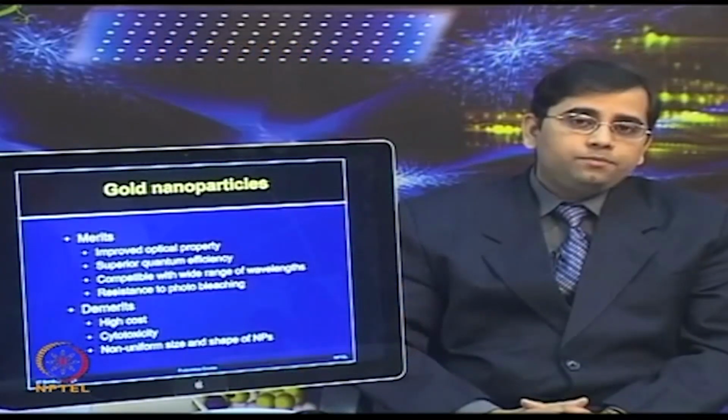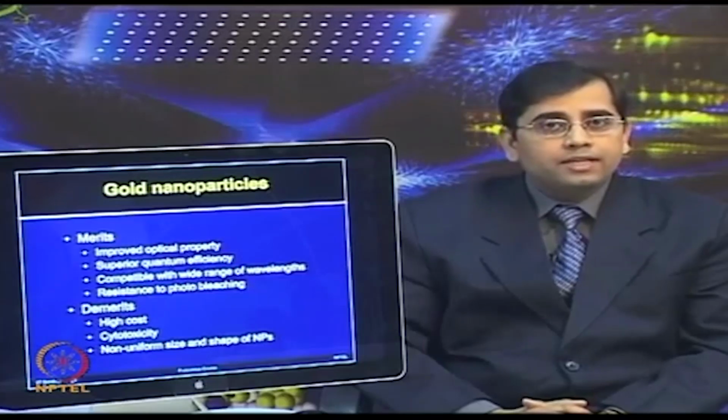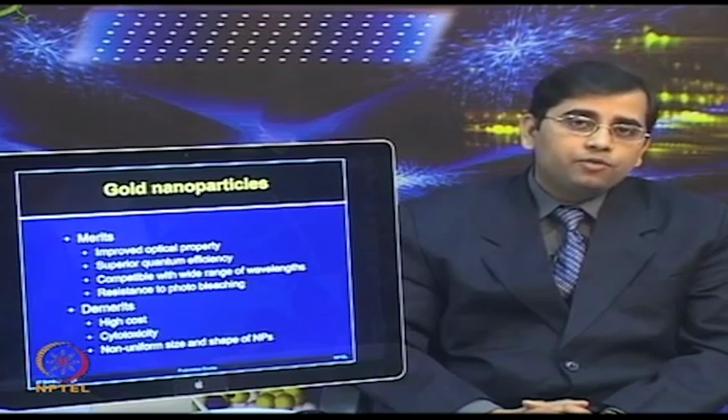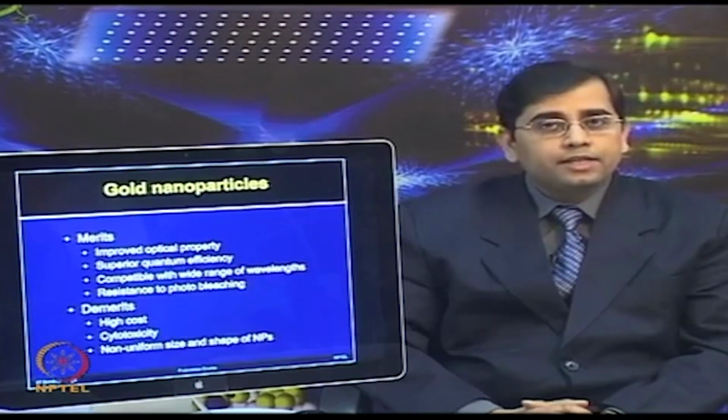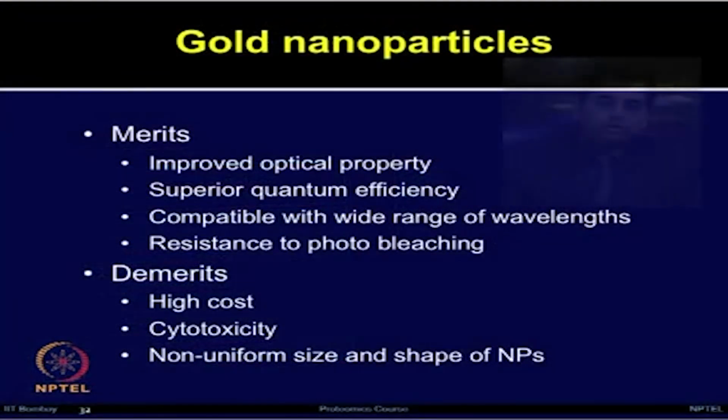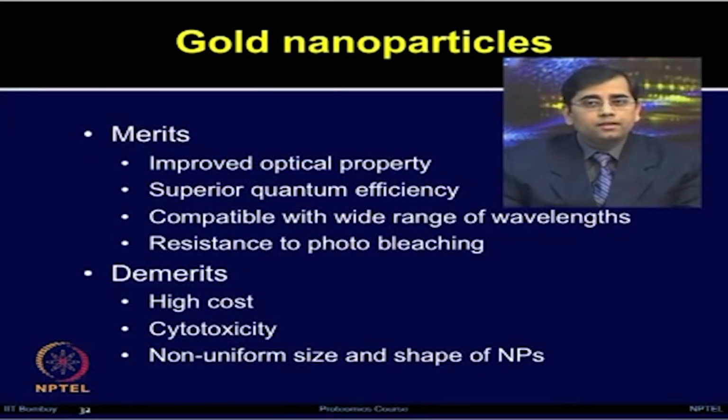Gold nanoparticles offer several advantages. They have been used for various applications for sensitive detection of standard proteins. They provide optical property, superior quantum efficiency, show compatibility with a wide range of wavelengths and chemical stability against photobleaching.